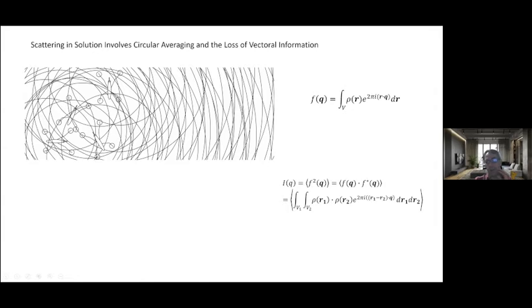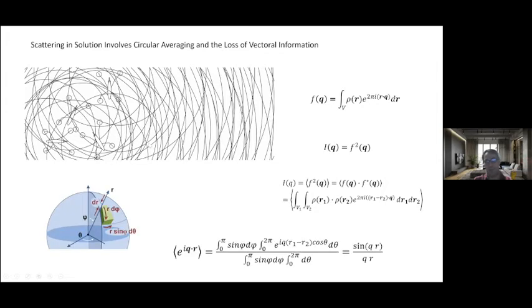And you'll see a lot of triangular brackets. Those brackets mean that you're averaging the information. So instead of nice, bright spots, you're going to get rings, and those rings actually won't be tight rings like you would have in a powder pattern, but they're going to be more blobby rings. So that's SAXS. And there's a lot of information loss. You almost would think there'd be no information, but there is. This sort of setup still gives you information about how far apart these legs are from one another, and that's what this workshop's about, is how do you take that information and get to some kind of structural information.